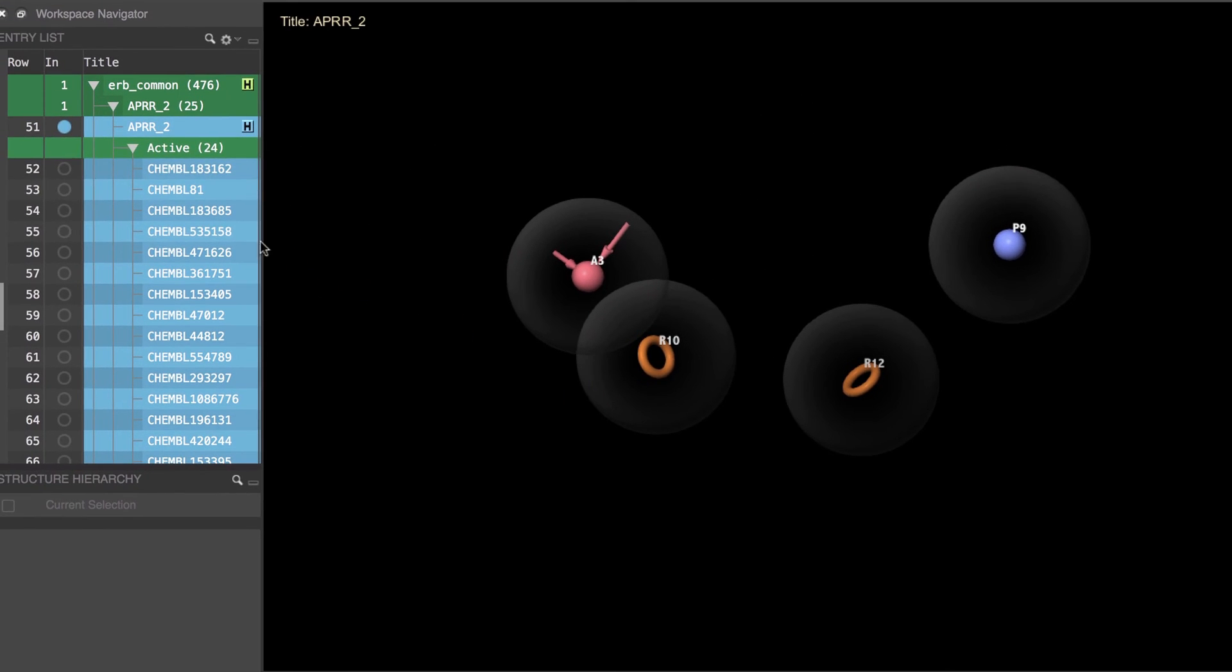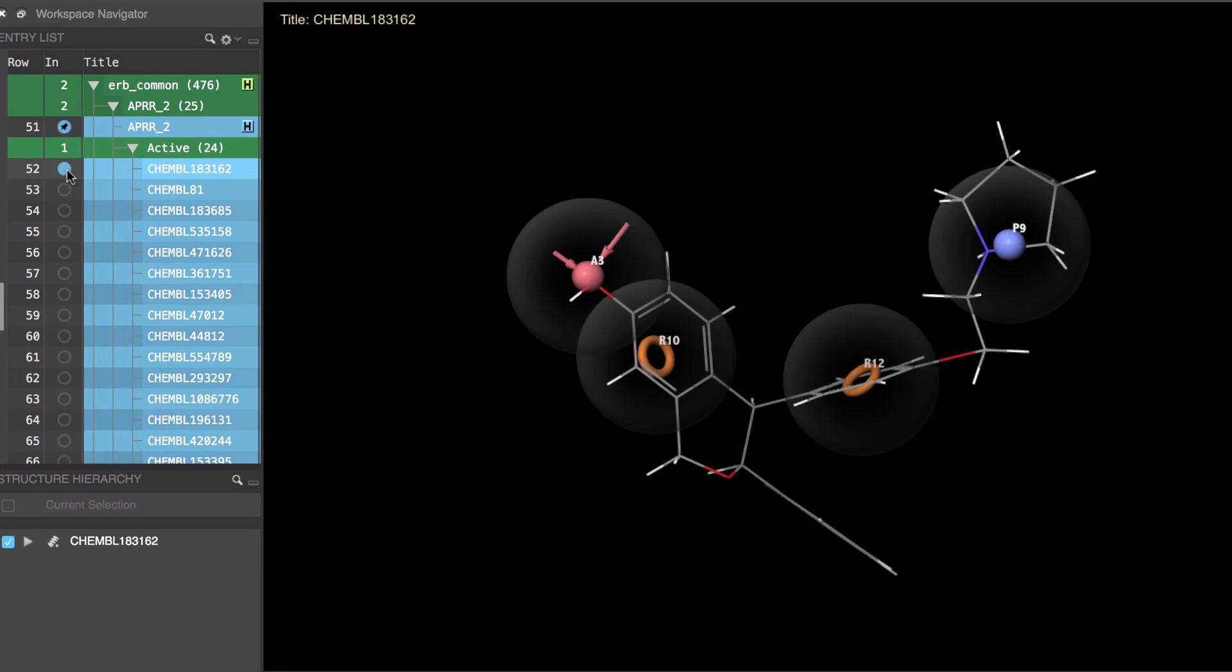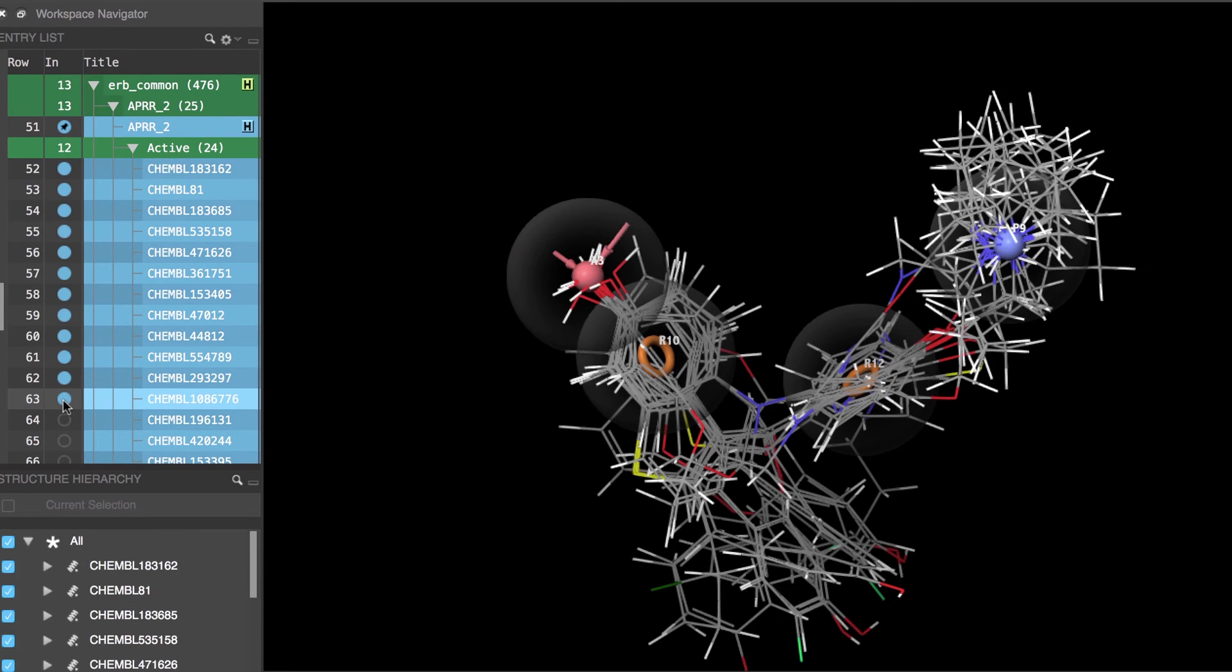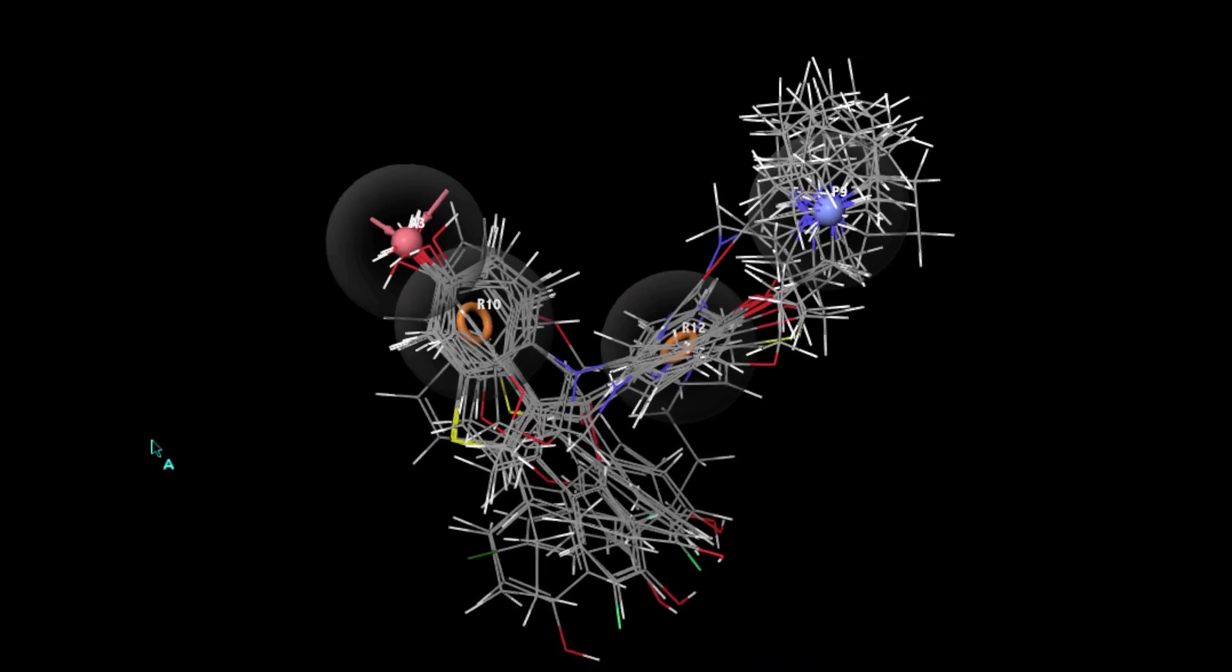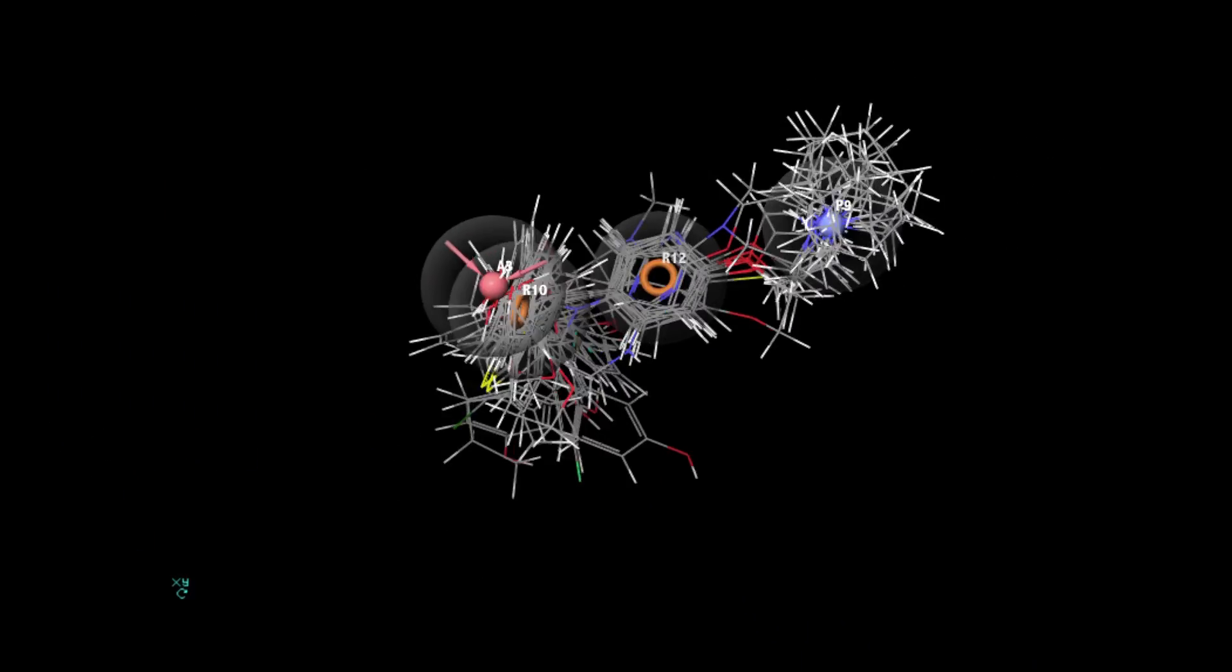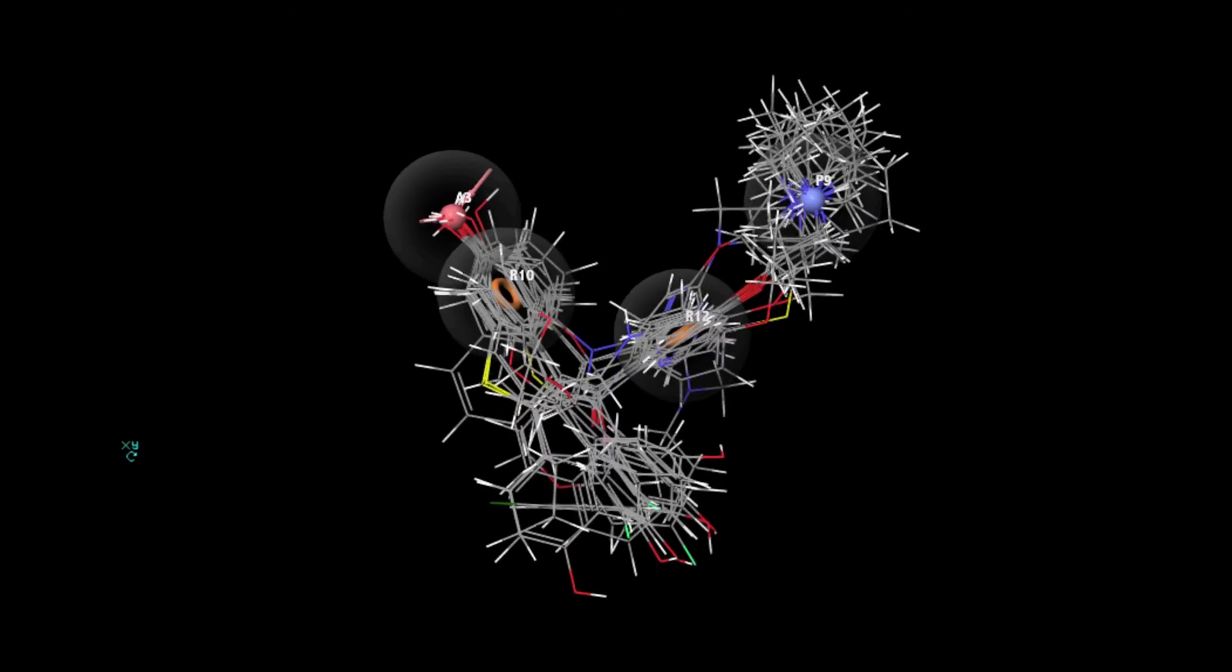Now if we double click the hypothesis inclusion icon we can fix it in place and then open the actives group to superimpose the actives used to create that particular hypothesis and see how they align.